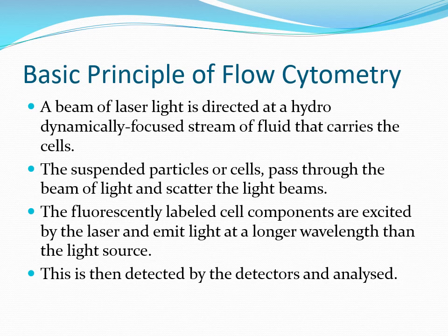So, what is the basic principle of flow cytometry? The flow cytometer performs this analysis by passing thousands of cells per second through a laser beam, capturing the light that emerges from each cell after it passes through this beam of light. The data is then gathered and analyzed statistically by the flow cytometer data analyst. This data can be used to determine the size, the complexity, the phenotype, etc. of the cell. The range of cell size that can be used for flow cytometry varies from about 0.2 to 150 microns. That's quite a large scale.